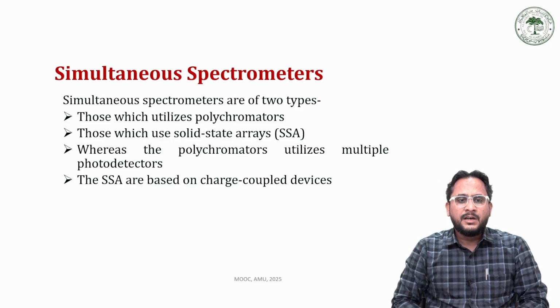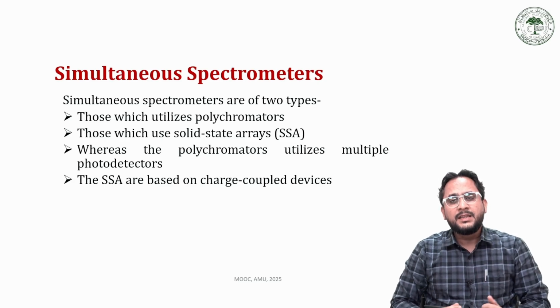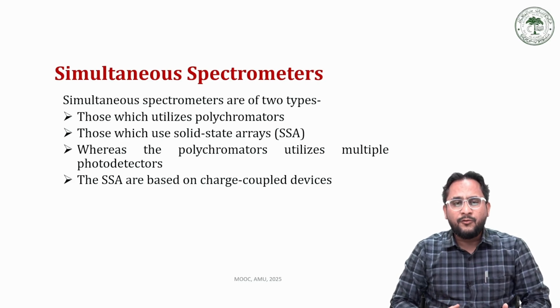Now this slide shows the simultaneous spectrometers that are basically known for simultaneous analysis of multiple elements at a time.